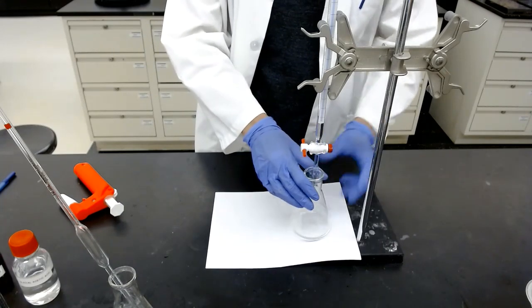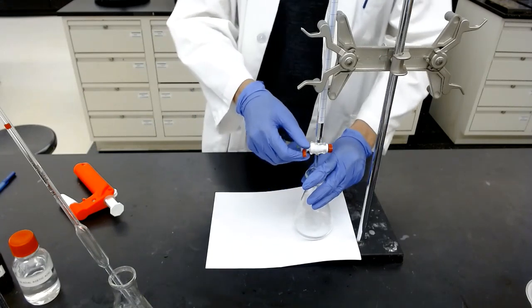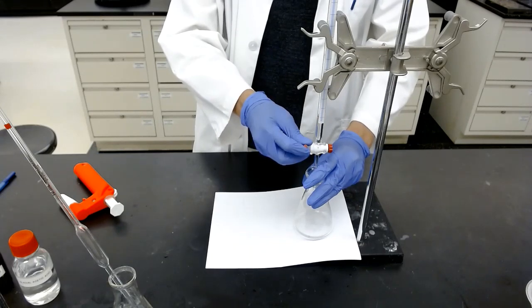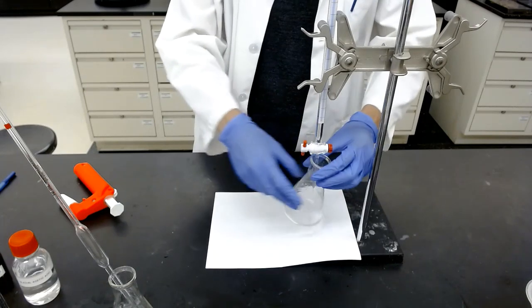Now the question again. So after what we did for 2 rounds of extraction, now how much base do we use? Is it less than the second titration or more than the second titration? What do you guys think? All right, I'm going to go ahead with the titration. You think about it.